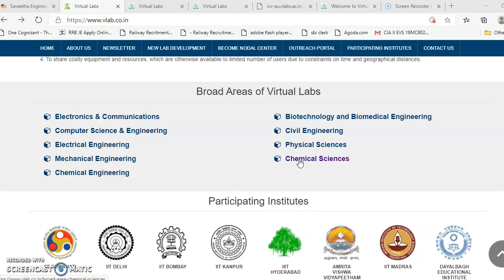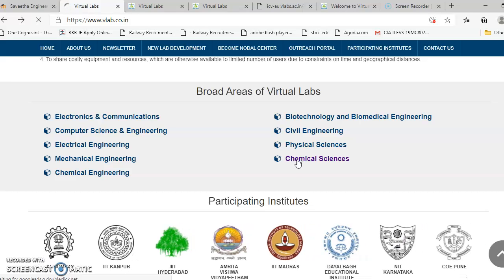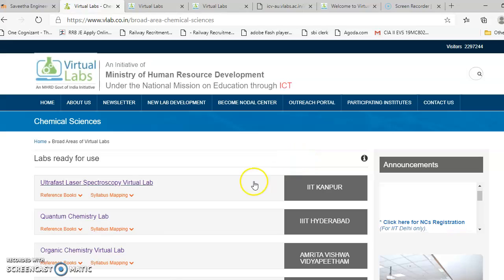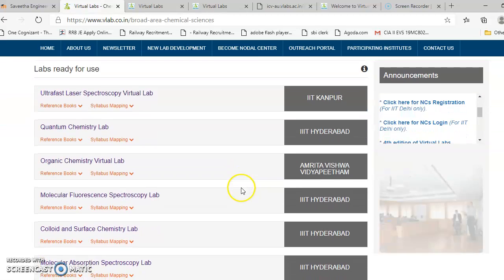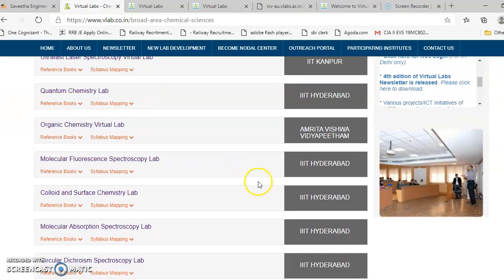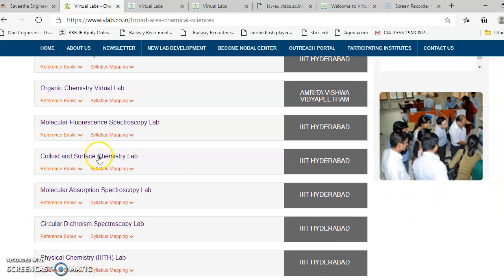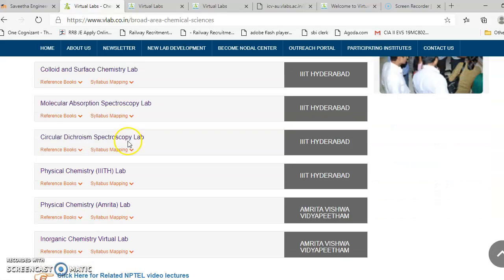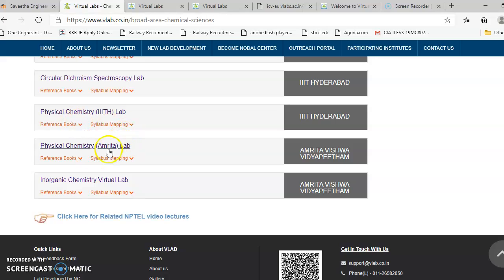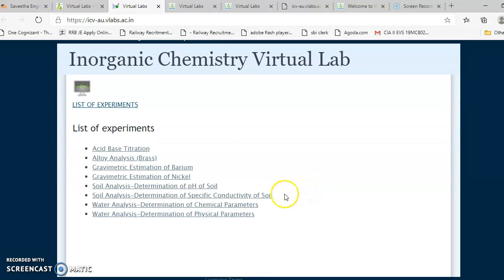First of all, let me introduce how to get into chemical science. You open chemical science where you can see a list of institutes which offer different experiments in different branches like organic chemistry, colloid and surface chemistry lab, physical chemistry, etc. Today let me get into the inorganic chemistry virtual lab offered by Amrita, where you can see a list of experiments.